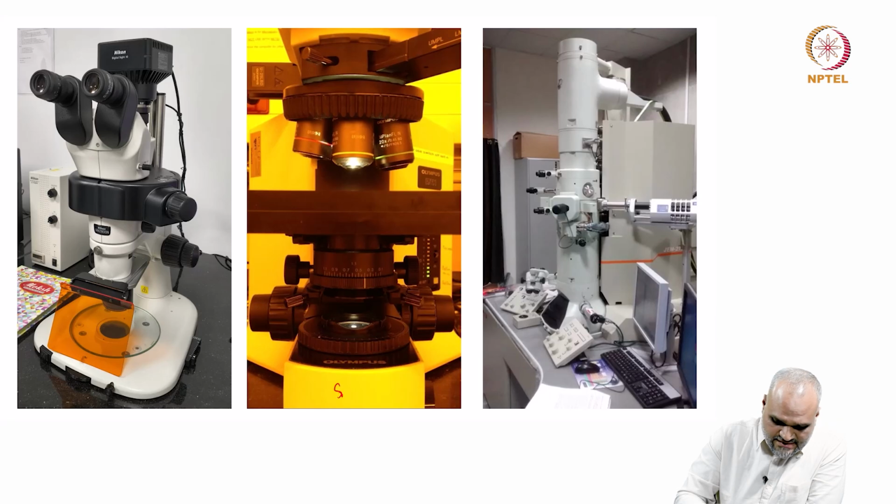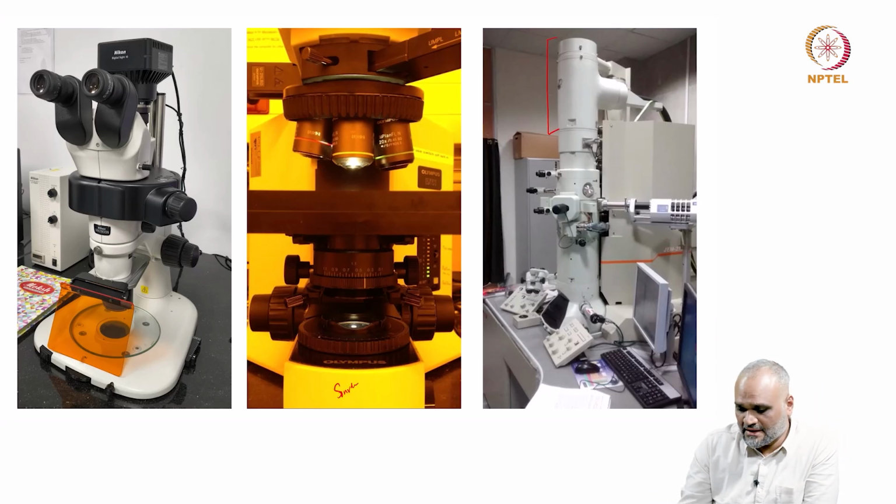So, I have a source here and I have a source here. I have the specimen stage here and I have a specimen stage here. I have objective lenses here and I have objective lens somewhere in this region. I have a condenser lens in front of the source. I have a condenser lens system here.